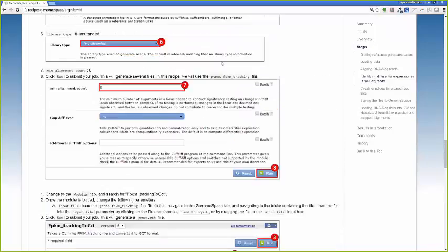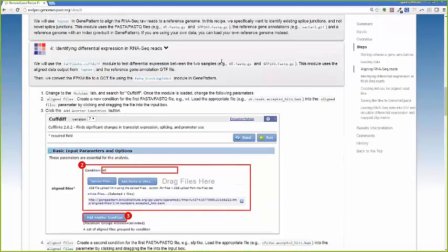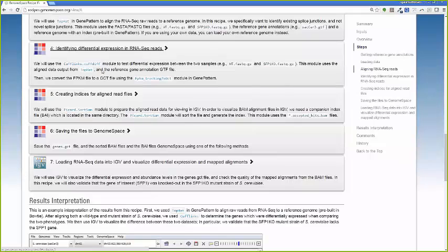So now we've completed the step in our analysis where we have compared the wild-type data set and the knocked-out data set, and we've determined which genes are different between those two data sets. And we've also created, or we will be creating, a new file type that will let us visualize that much more easily. At this point, you could potentially take that GCT file and do other analyses with it. GCT files are often viewed as heat maps.